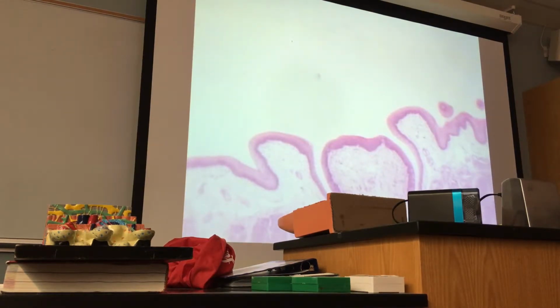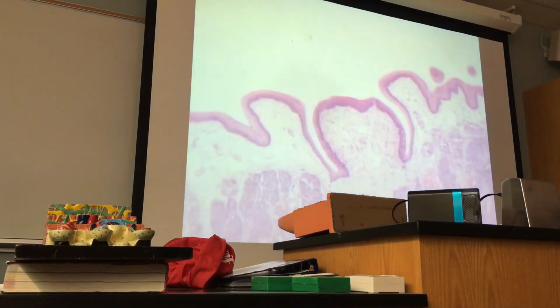circumvallate papillae do not have keratinized stratified epithelium, just non-keratinized stratified epithelium, like smooth. Can you see that? This is smooth, and this is the groove here, and this papilla has taste buds on the border. The taste buds will be evident under higher magnification.